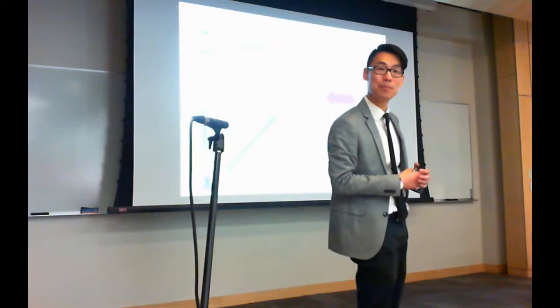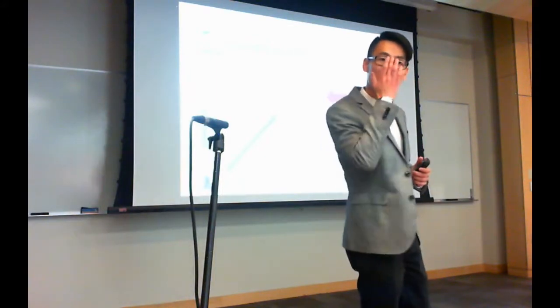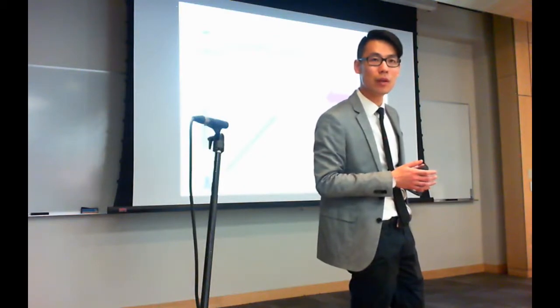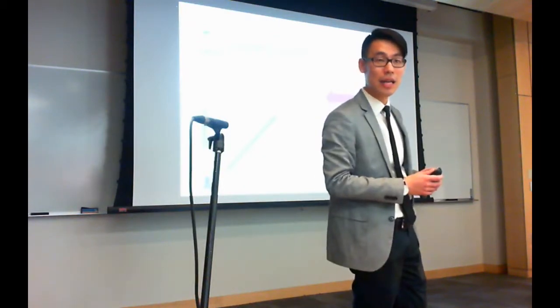Yeah? So the library, each data point is just like a 1D function where at each mass you have the percent or whatever? Yes, so yes. It's a pretty small amount of data. It is pretty small, yes.